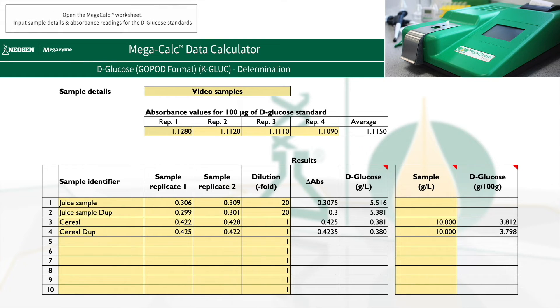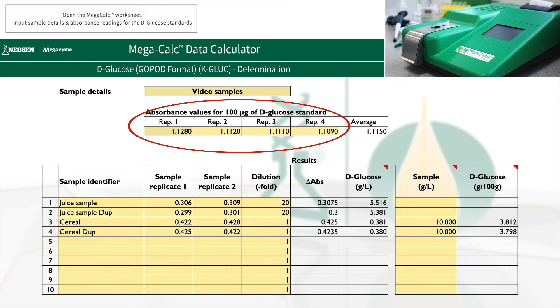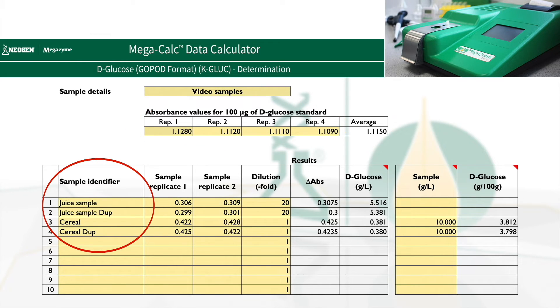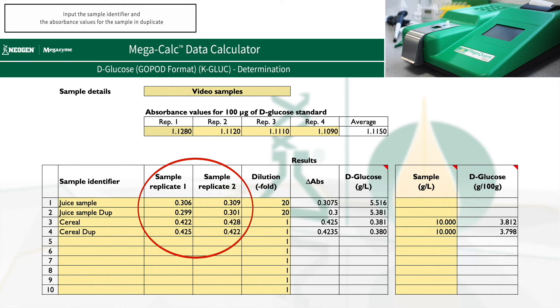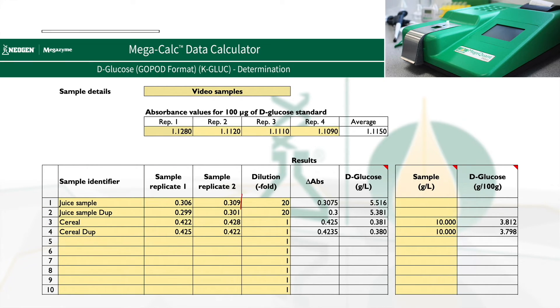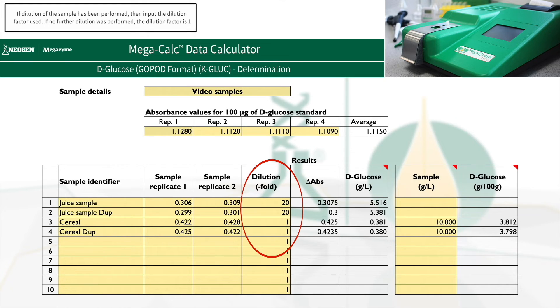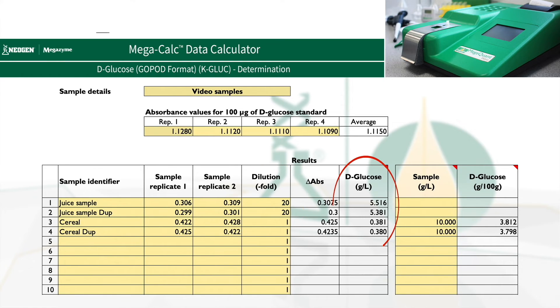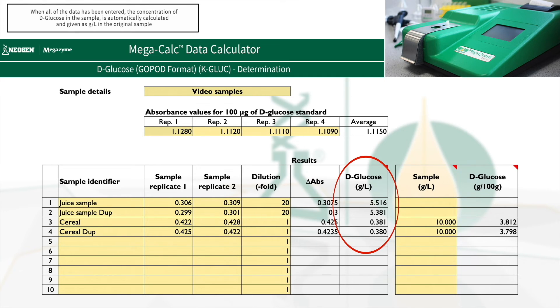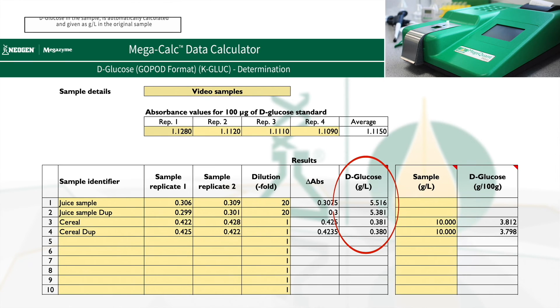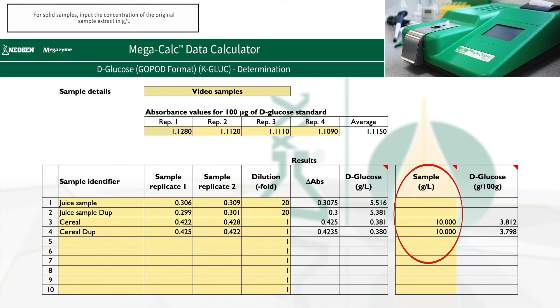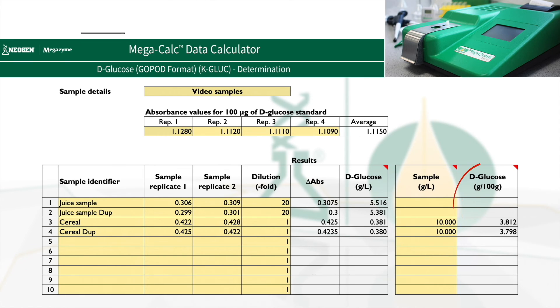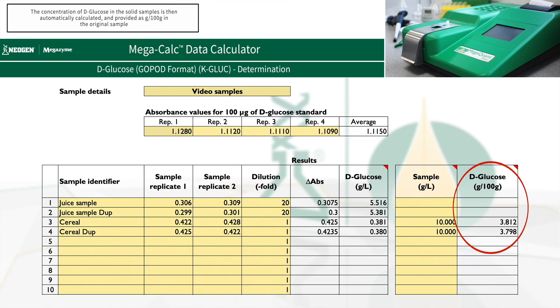Open the MegaCalc worksheet and input the following sample details: absorbance readings for the D-glucose standards. For each sample, input the sample identifier and the absorbance values for the sample in duplicate. If dilution of the sample has been performed, then input the dilution factor used; if no further dilution was performed, the dilution factor is 1. When all of the data has been entered, the concentration of D-glucose in the sample is automatically calculated and given as grams per litre in the original sample. For solid samples, input the concentration of the original sample extract in grams per litre; the concentration of D-glucose in the solid sample is then automatically calculated and provided as grams per 100 grams in the original sample.